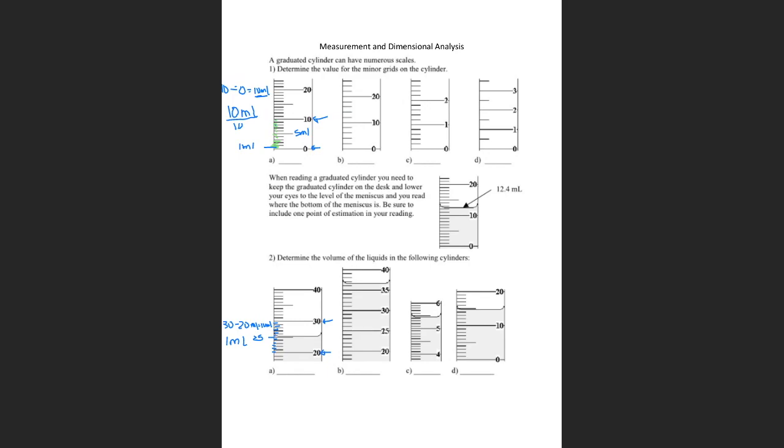So you want to look at this part right here. It's hard to get my mouse right on that spot. Here and here. So based on the reading we have here, I currently have 25. I'm about to estimate the next number right here. To figure out that number, I'm trying to look and see. The liquid there is occupying, for me, it looks like about a quarter of the available space. It's not really half. It's less than half. You can estimate a third or a quarter.